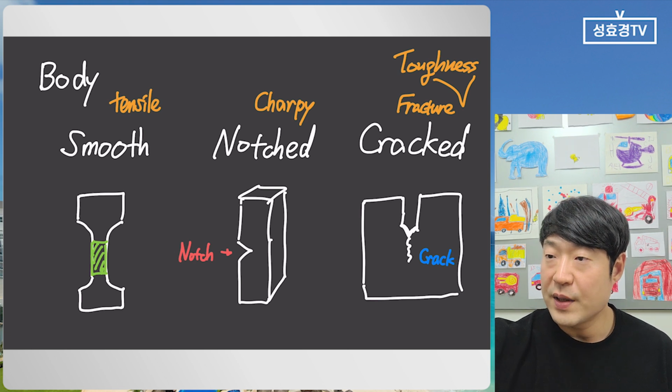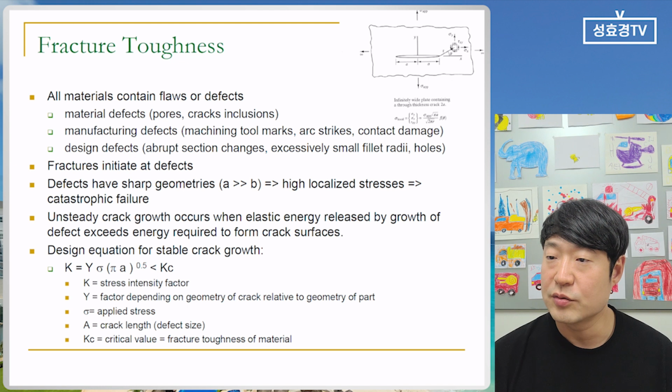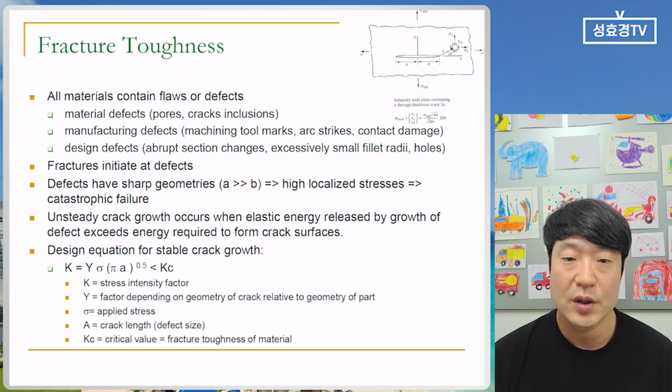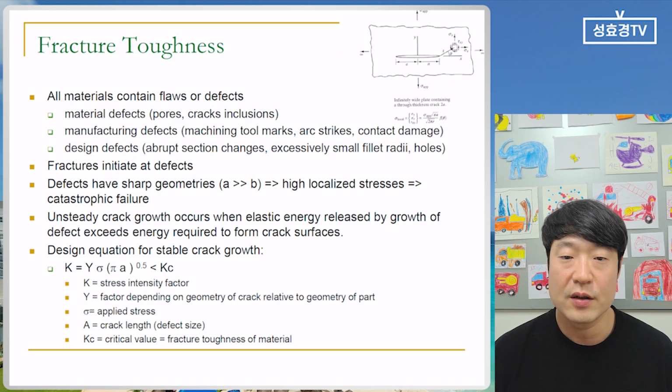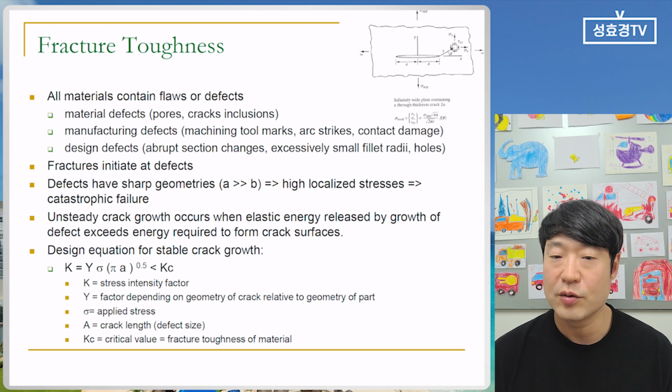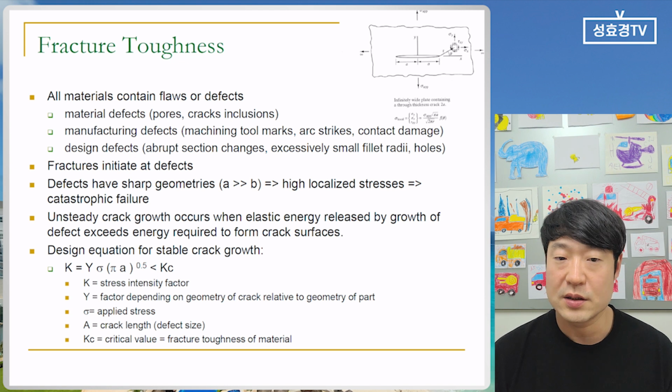So let's go back to this part, the fracture toughness. We will talk about this part, and in the next class, we will talk about the fracture toughness test. We will have a chance to give you a lecture on this part in the next class. So today, we can summarize. We just learned about Charpy impact properties, the Izod test, the bending test, and a lot of tests for hardness testing. That is a very important testing method to understand.